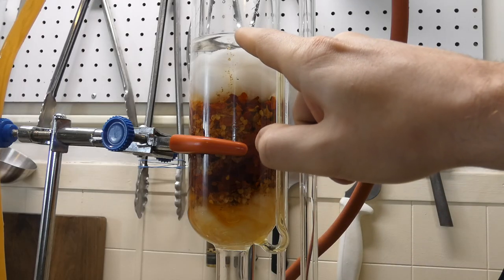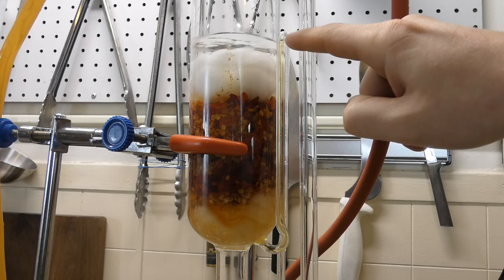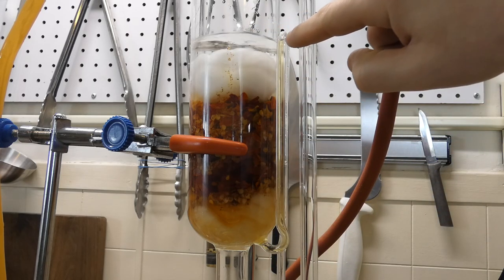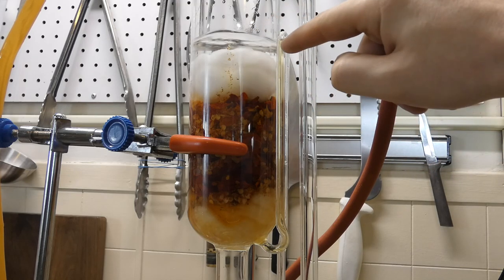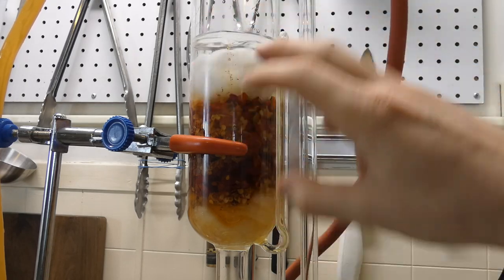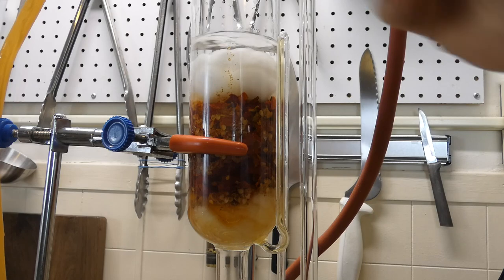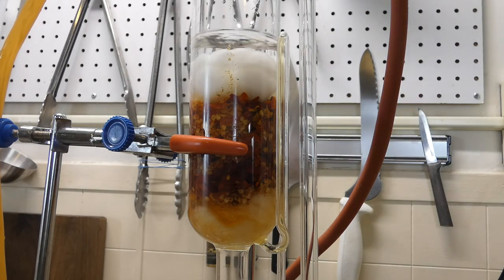All right, as you can see, the ethanol is lining up pretty much perfectly with the ethanol in this tube that has all of the capsaicin in it. It's lined up perfectly. Now, in a few moments, this is gonna go over the edge. As soon as this comes up to here, this will come up to here, and it'll go over the edge and go down into the flask. It's gonna create a siphon and pull out all of the liquid pretty much until about right here into the flask, and then it's gonna recondense again and continue the cycle over and over. It's gonna happen very quickly when it does happen.